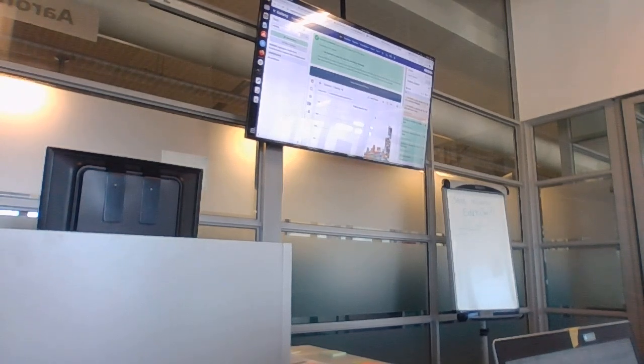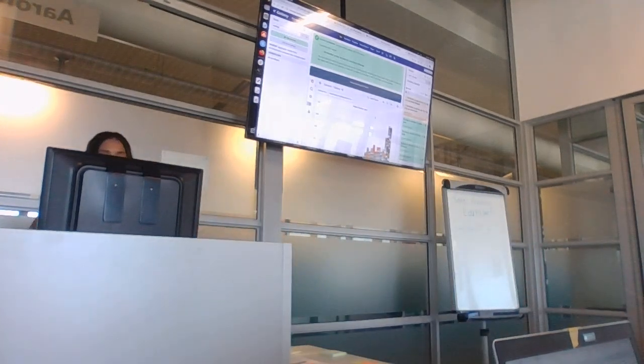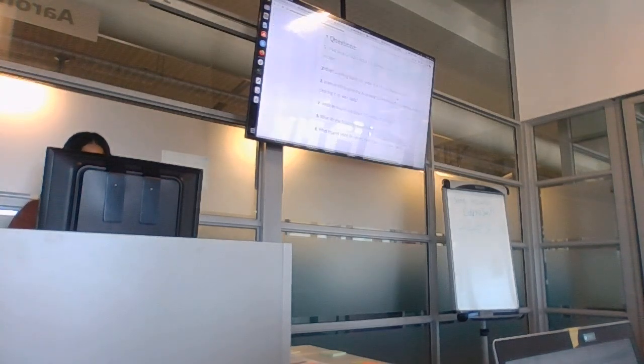You must select, click on that one. Okay, whose MultiQC is running? Who's done? Who's just waiting for catch-up? Everybody to catch up. If you are done with the MultiQC, please answer the questions. Running, yeah. So let's wait for it. Or see if you can answer.